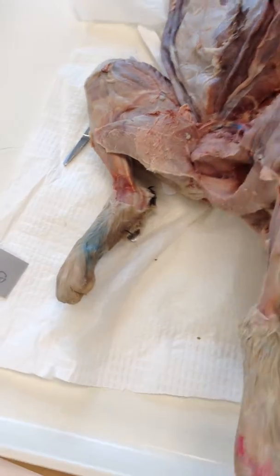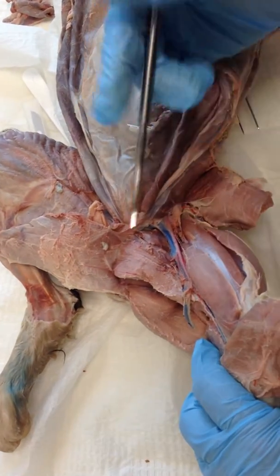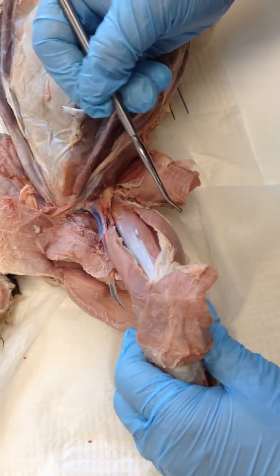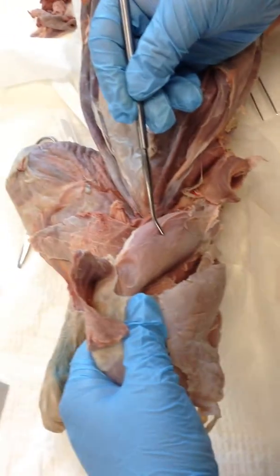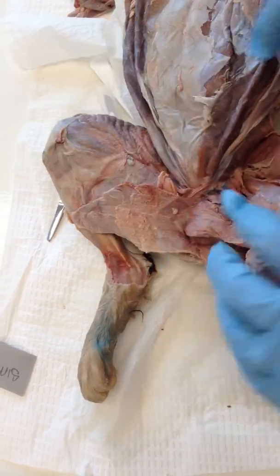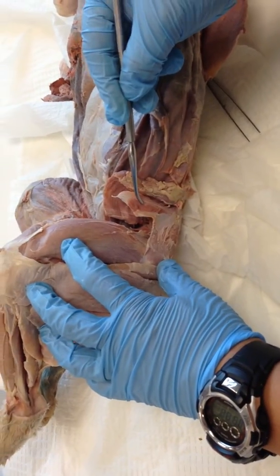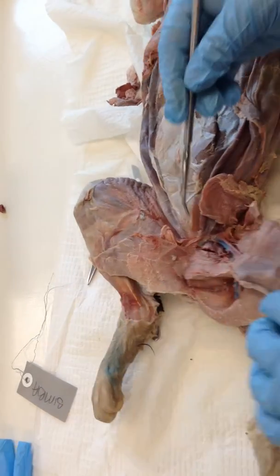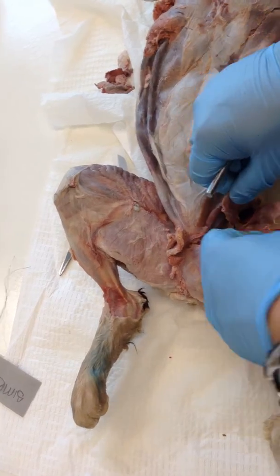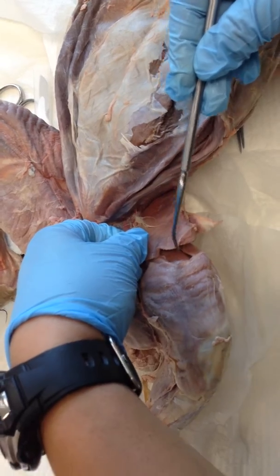Vastus medialis is deep to the sartorius. This is the vastus medialis, rectus femoris, vastus lateralis, and the cut part right here is the tensor fasciae latae, and this is the gracilis, which we cut right here. That's the gracilis. And another cut portion here is the sartorius. These two right here.